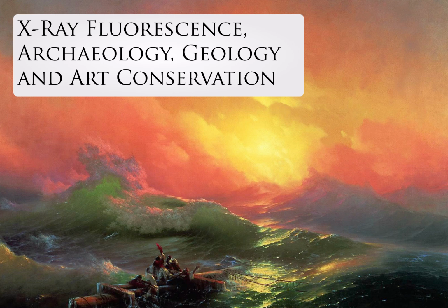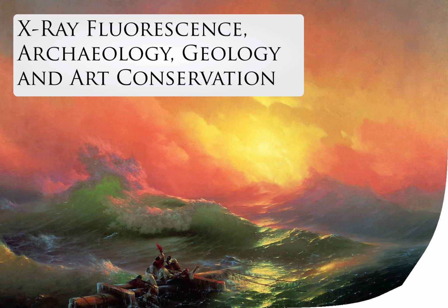Typically, X-ray fluorescence involves the analysis of homogeneous samples. This makes it relatively straightforward to create a quantification procedure. However, for pigments in a painting, inclusions in a rock, or ancient paint on ceramics, the answer is not so straightforward. It's a much more heterogeneous material. But if we learn a little more about the physics that underlie X-ray fluorescence, we'll understand how to handle these challenges and, as an added plus, learn more because of them.